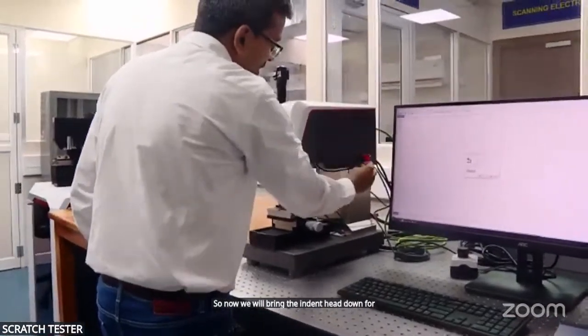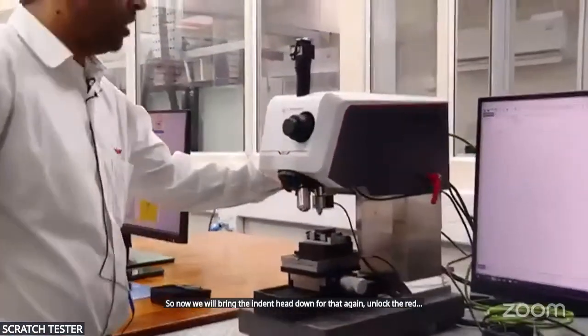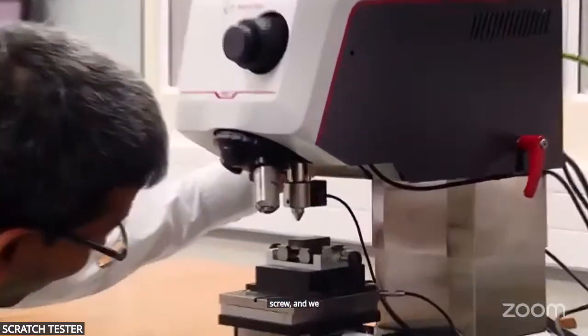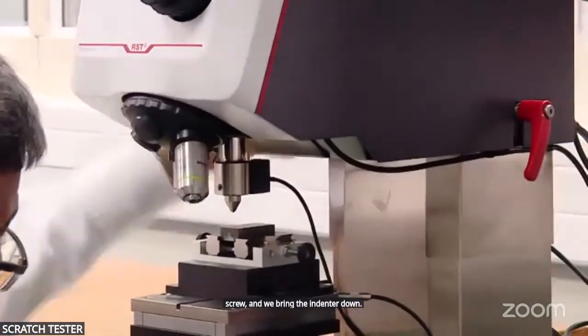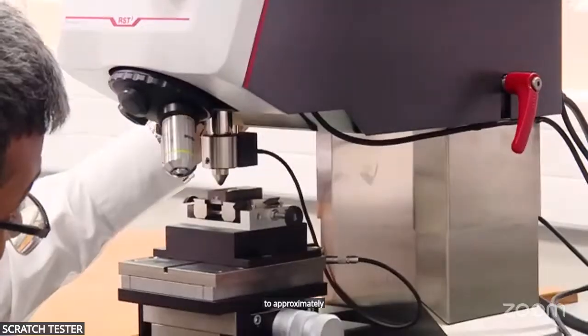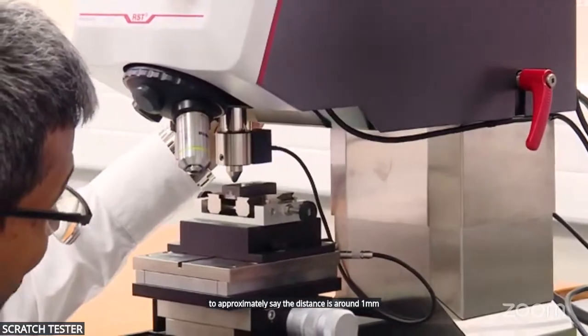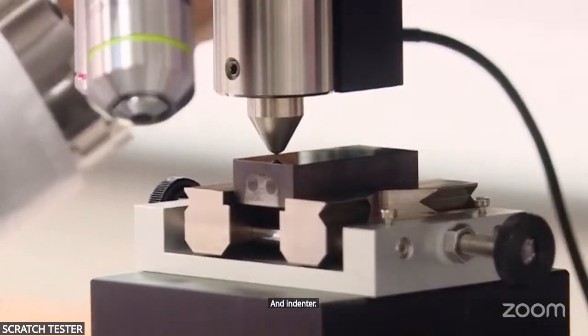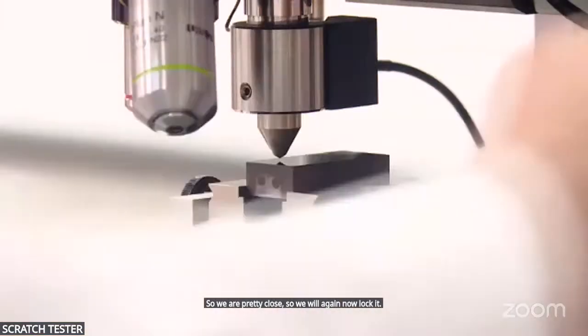For that, again unlock the red knuckle screw, and we bring the indenter down to approximately 1 mm between the sample surface and the indenter. So we are pretty close. So we will again lock it and we'll click OK here.